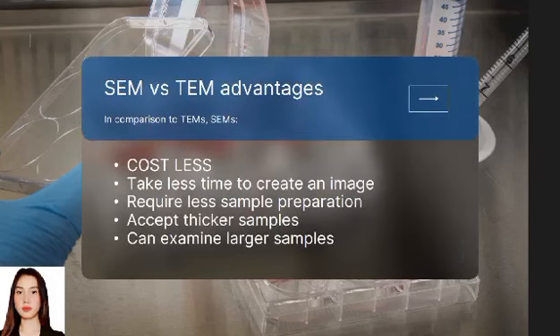Now, let us proceed to the SEM versus TEM advantages. In comparison to TEMs, SEMs cost less, take less time to create an image, require less sample preparation, accept thicker samples, and can examine larger samples.